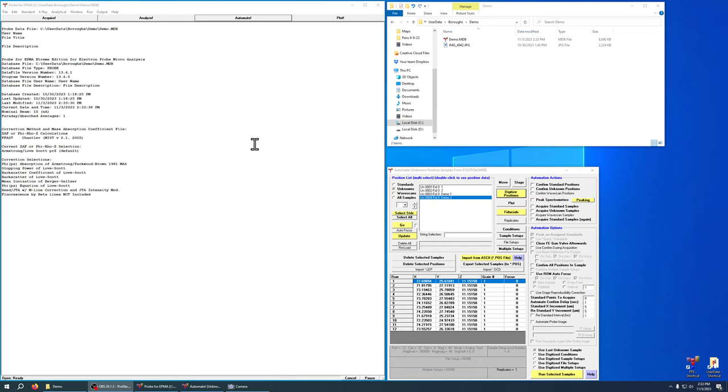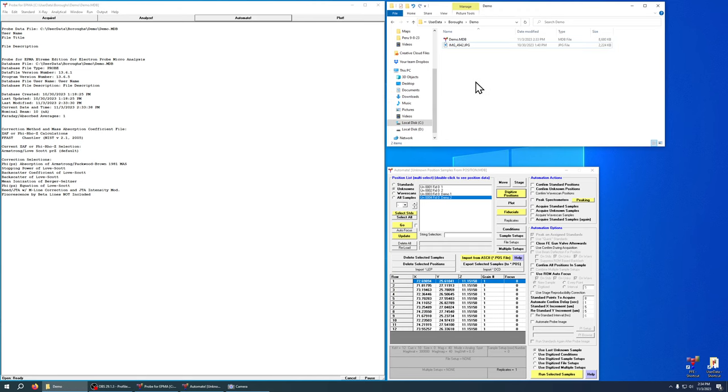This is going to be a quick tutorial on how to use the picture snap feature in Probe for EPMA in order to navigate around your samples using an image you've taken of the sample. So to do that first we need a picture.